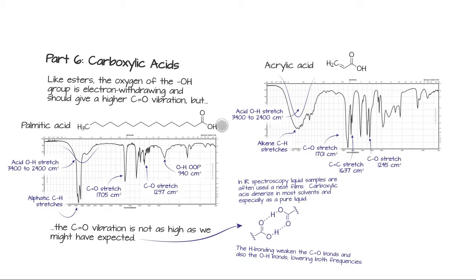You sometimes see the OH out of plane bending, which would be bending here in this hydrogen bonded situation. But that's not too diagnostic because often the fingerprint region is pretty busy. I would concentrate on the fact that the OH stretch is broad, enormously broad, and significantly lower in frequency than in alcohols. That's the diagnostic one right there for acid peaks. And then your carbonyl stretch is a little on the low side, but really the slam dunk is look where this massive OH peak is.